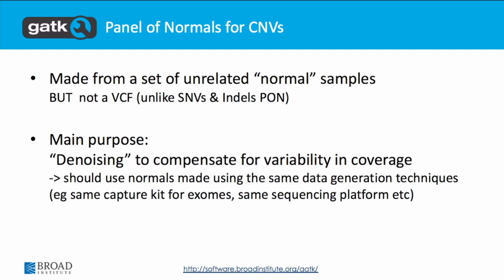These are the main concepts that are going to come into play. And again, on Thursday, we will do some hands-on and go into more detail into how the algorithms actually work. Are there any questions? No? Yeah? Relating to the coverage, is your recommendation for at least 30 and even more if possible? Yes, we also say minimum 30, but again, please use more if you can.